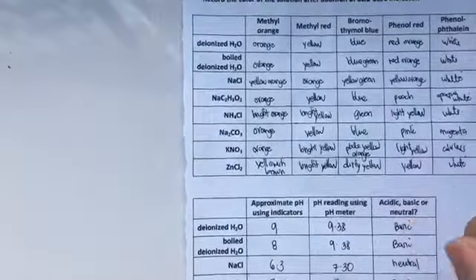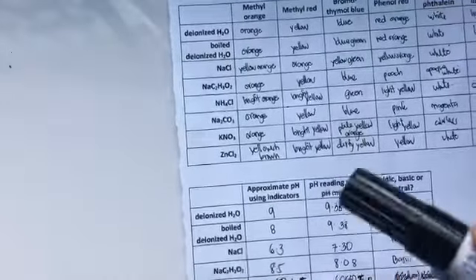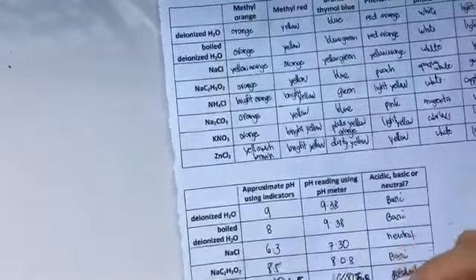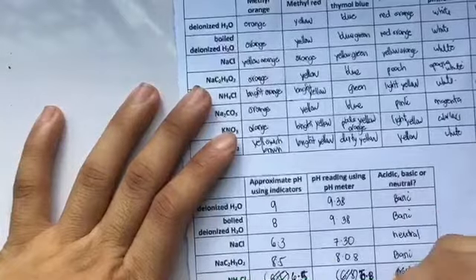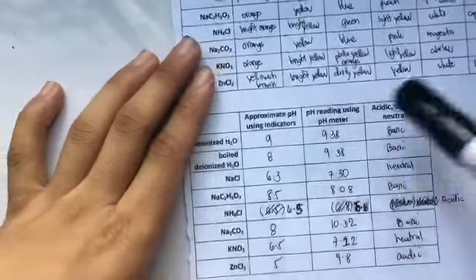So ang mga acidic lang natin na sample will be the ammonium chloride and then the zinc chloride. And then the neutral sample will be the sodium chloride and then the potassium nitrate. And all of them are basic. And also, so we use several indicators.